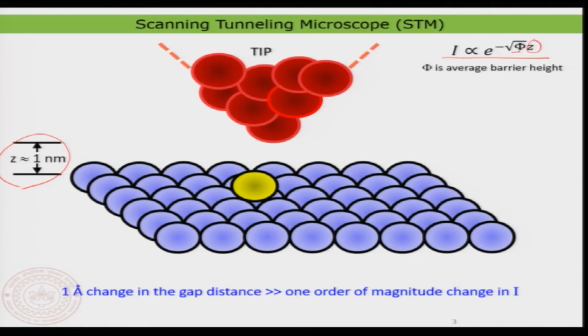It is actually some kind of a potential barrier that limits the electrons from going through, because as you see directly in the image, there is some kind of a vacuum between the tip and the sample. They are not connected. Yeah? So, that is the interesting thing. They are not connected, but there is a gap in between, and I am assuming that all this is happening in a vacuum space, which means that there is no medium, which means there is a barrier. There is a potential barrier that limits the electrons from passing from the tip to the surface. Well, that is what the tunneling itself means. It is a quantum mechanical phenomenon we will see in the next slide.